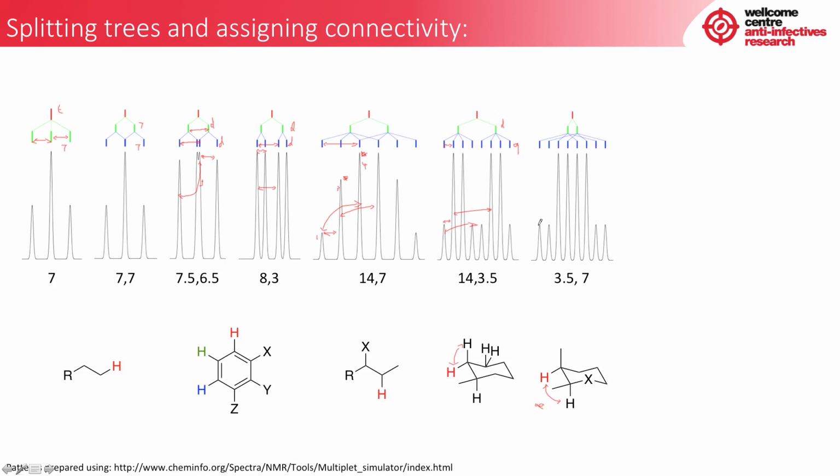And here is the first line in our first quartet, but instead of having a 3 beside it, we have another 1, and this means that this is the second quartet, and so this time this is our doublet splitting, and if we want our quartet splitting, we're actually going to have to go to here, and that is this space, and it gives us a larger J value.